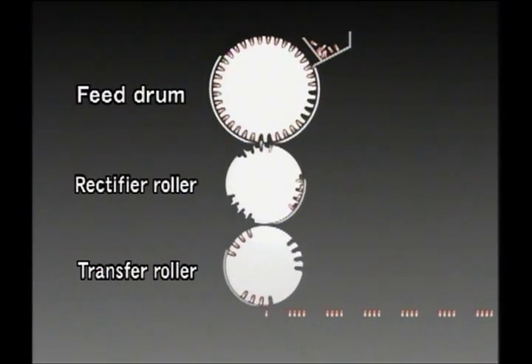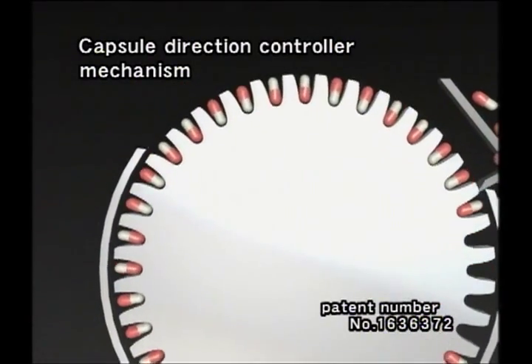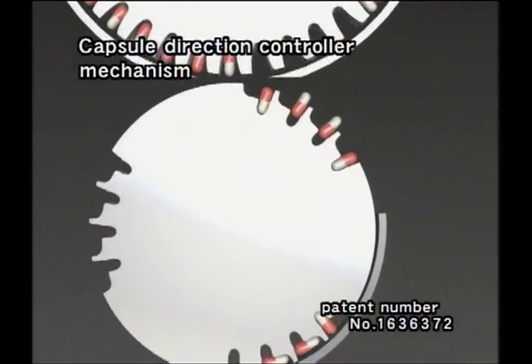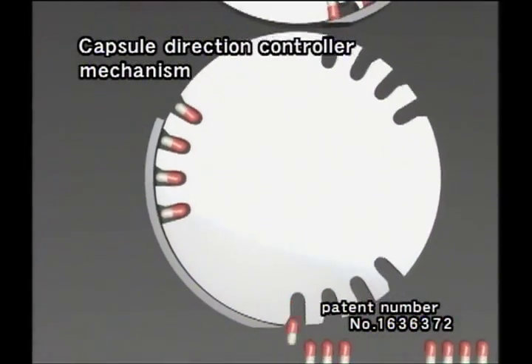This mechanism is QualiCaps' original technology with a worldwide patent. It prevents capsule defects such as deformation, scratches, as well as peeling of imprinted characters, since no external pressures are applied to capsules. This mechanism can also be applied to various machines such as the capsule sealer, the printer, and even the appearance inspector.